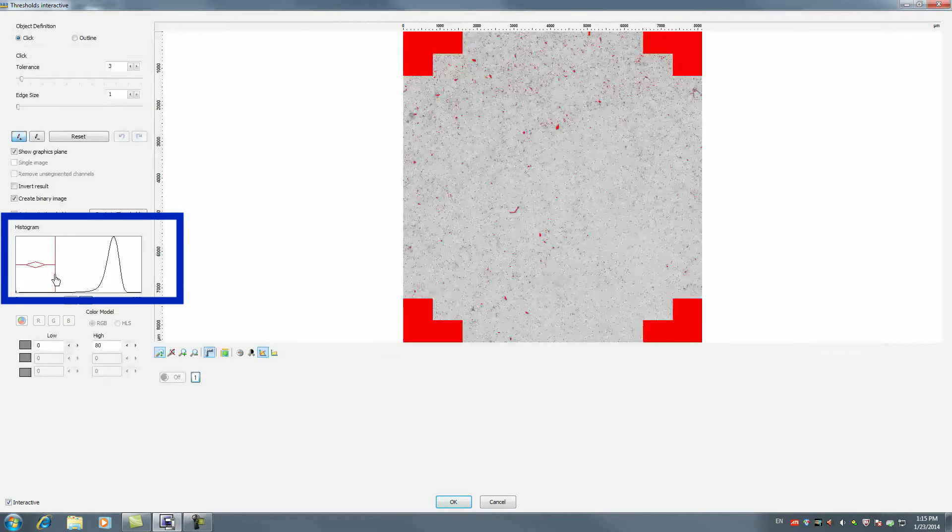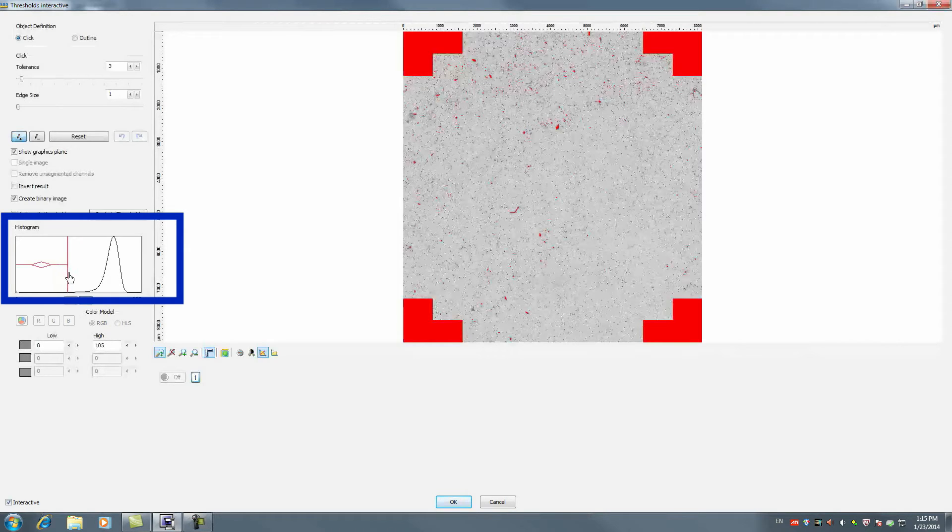Define a suitable gray value range to segment relevant particles. This is done by sliding the controller to peak increase.